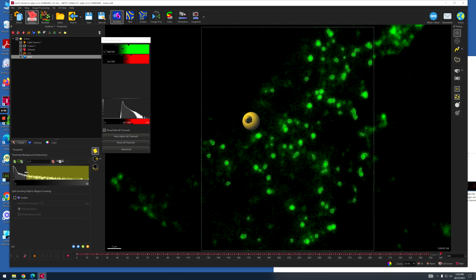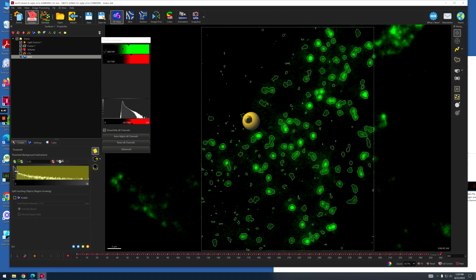Here, I don't have a good answer for that. Just try your best to see the best result, and sometimes you need to go back here to adjust things. It takes some time to figure out what is best and what best reflects what you see.